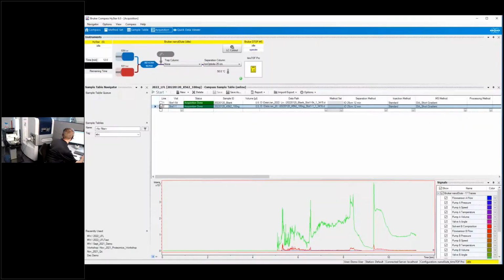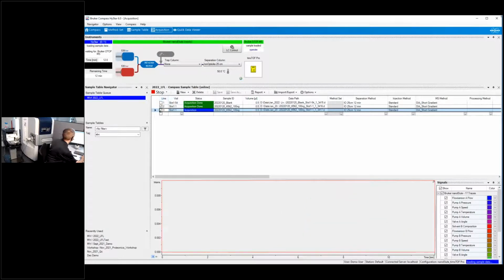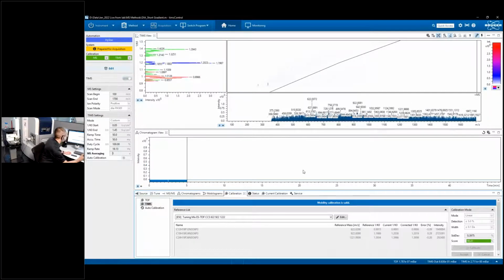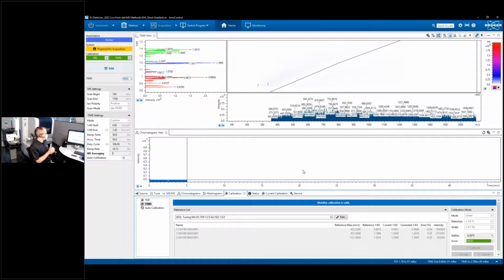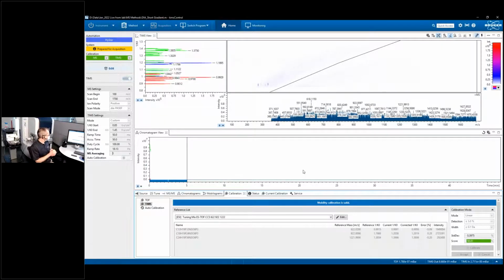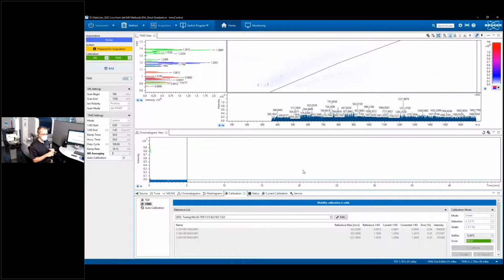I can. Let's quickly add another run here, and set that going. Hopefully we'll be able to see something acquiring before the end of the session. Okay, cool, so we'll let that go. But we've got some other good questions here. Question about throughput: what's the possible throughput on the timsTOF Pro 2 using dia-PASEF?